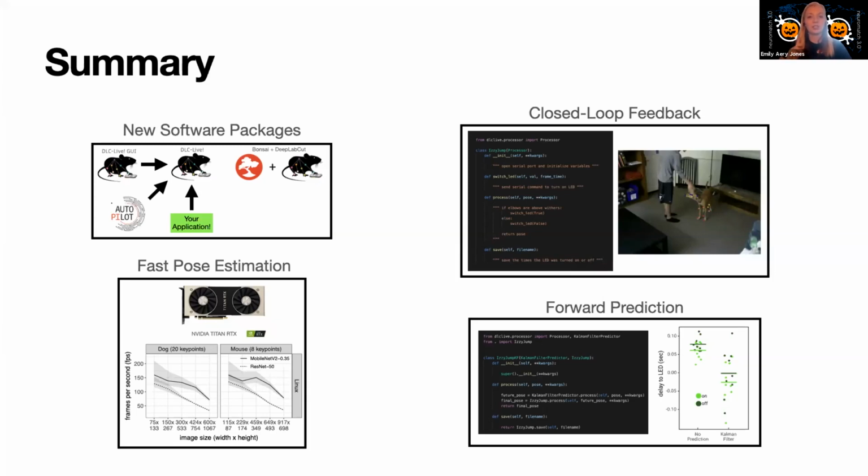unusual, especially seizures. Being able to classify seizures behaviorally would be really nice, but it also seems like it would be quite a challenge once you get into the full tonic-clonic seizure range, and the possible position of any part of an animal is literally anywhere in the video camera space. Yeah, I mean, you wouldn't have to label absolutely everything, but you're going to need to get a good range of things.